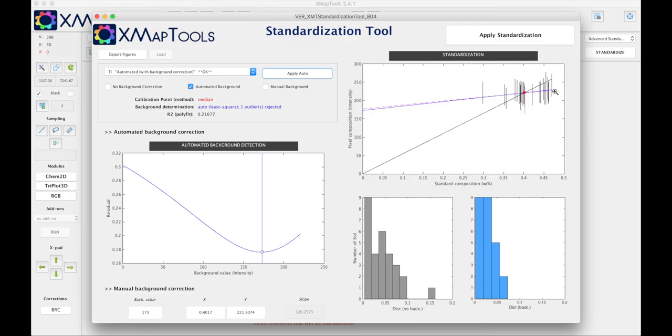If you get a restricted range of variation for titanium it would be fairly similar, but if you have a large variation range then it's important to correct for the background.